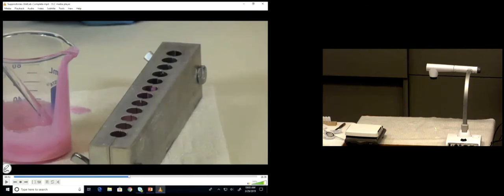However, she's now poured everything out, but is there still a bunch of colored goo left in the beaker? Because it's already starting to solidify. So we want you to rinse. Make note of this in your margin: do not rinse more than 3 times. You will still have drug left in your beaker. It's impossible to get it completely clean.